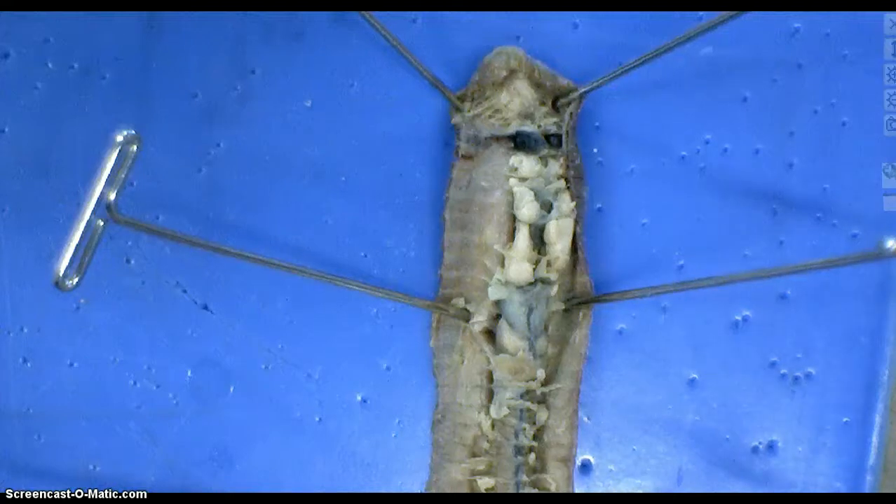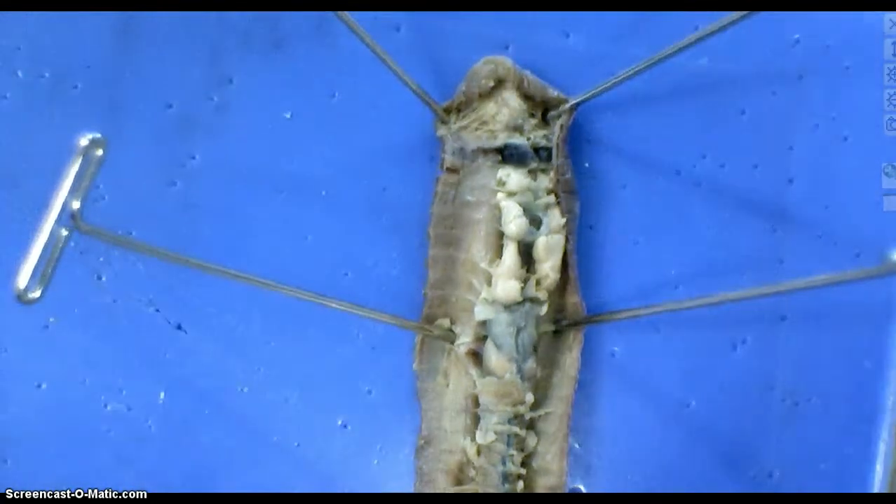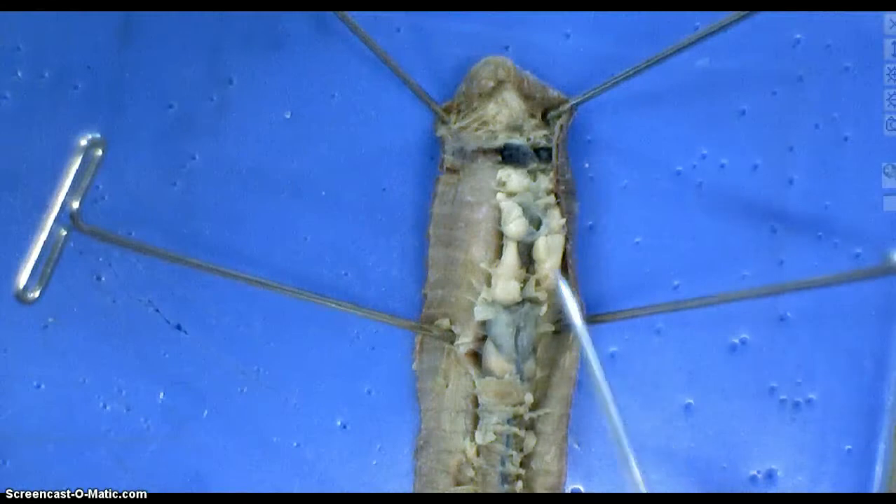All right, we are back. We have adjusted the focus, so now we're quite a bit closer, and now we can see different structures.